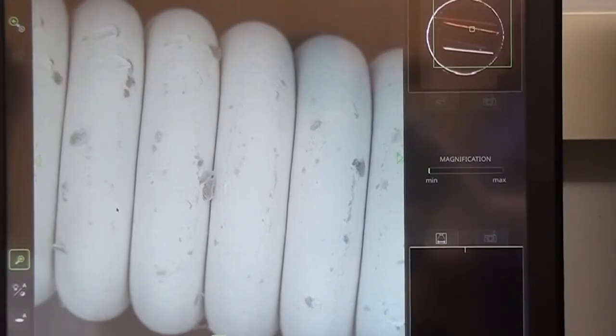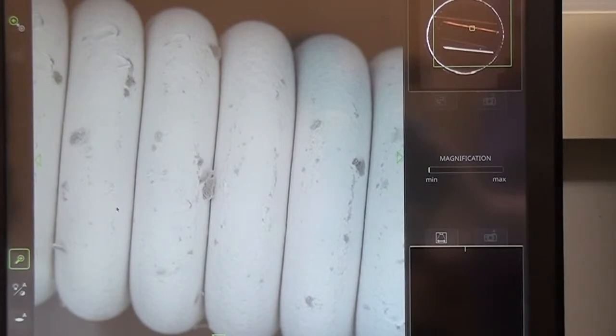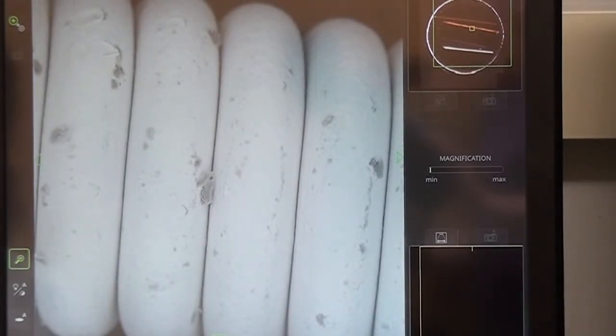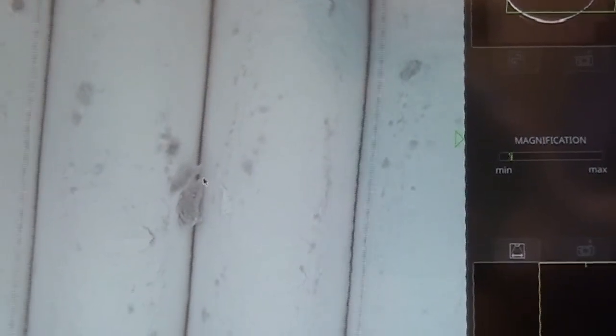This is the image of a copper metal with SEM, and we can see the nice layers look very clean, a coil kind of structure here. There is maybe some either dirt or some oxidation, some signs of oxidation here, and we can zoom in to investigate.